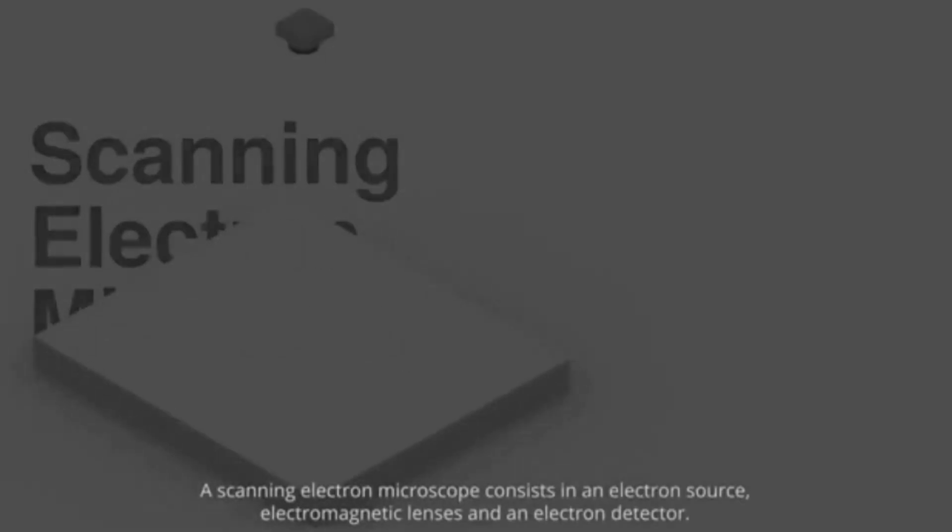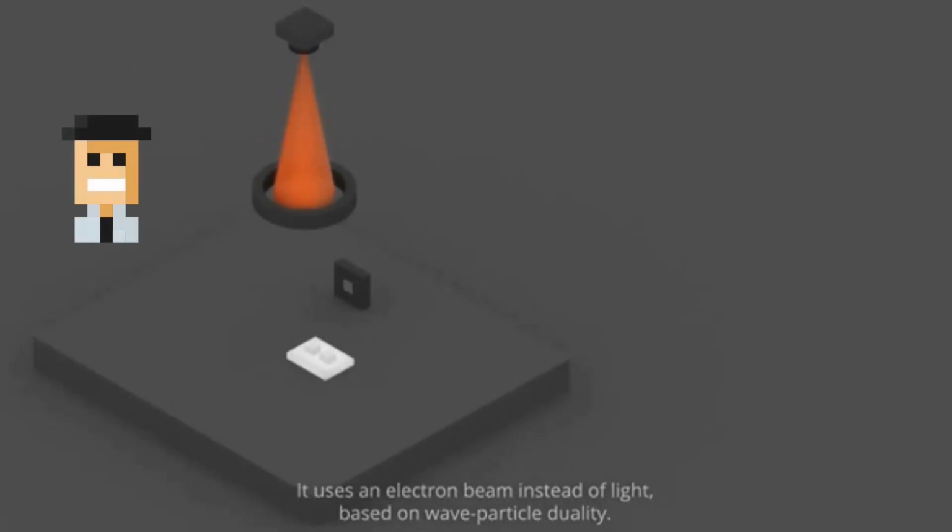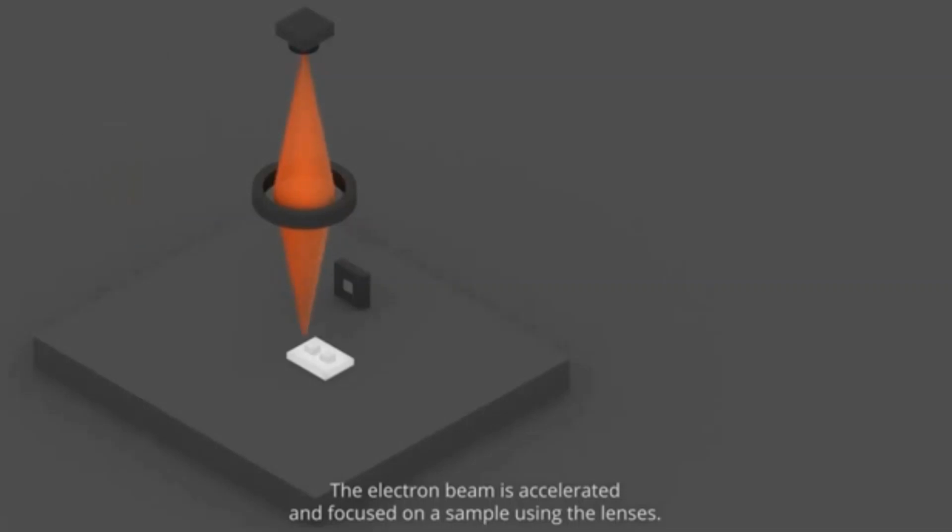What are the internal components of SEM? A scanning electron microscope consists of an electron source, electromagnetic lenses, and an electron detector. It uses an electron beam instead of light, based on wave-particle duality. The electron beam is accelerated and focused on a sample using the lenses.